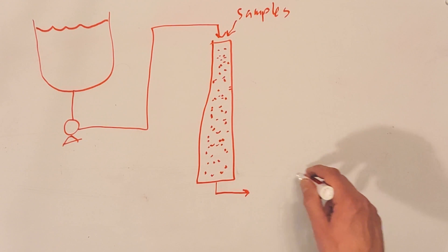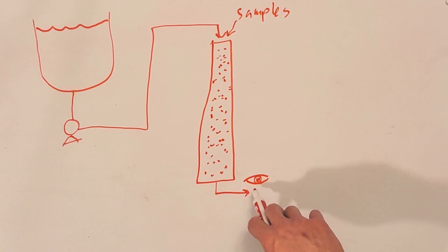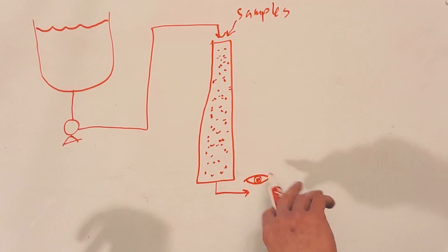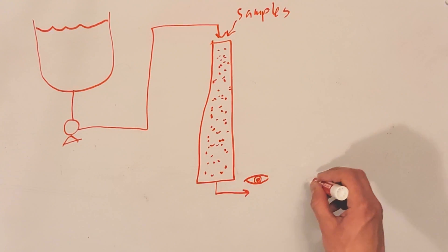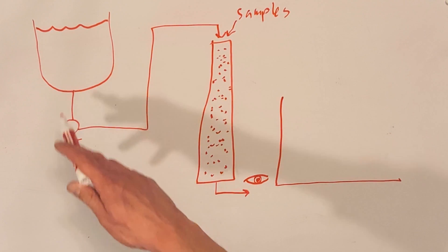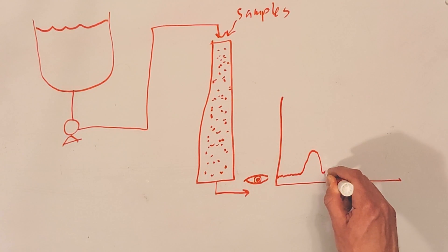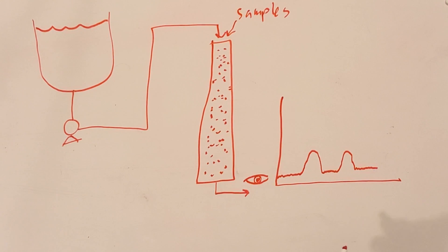On the other side, if you have a detector, you can watch as the samples come off. All these compounds fluoresce under different wavelengths of light — typically these are ultraviolet detectors, but you can have a visible light detector or all sorts of different detectors. You'll get a graph where first your mobile phase comes off by itself, then as CBD comes off you'll have a hump, then nothing, then the THC will come off. That is best case scenario — it usually doesn't happen perfectly unless you have everything dialed in, which on an HPLC system is honestly very feasible.